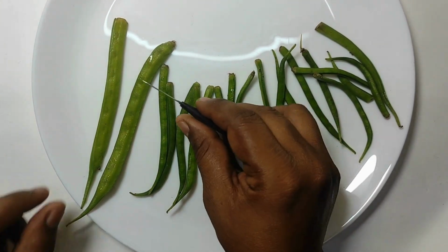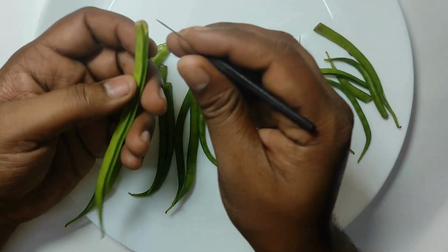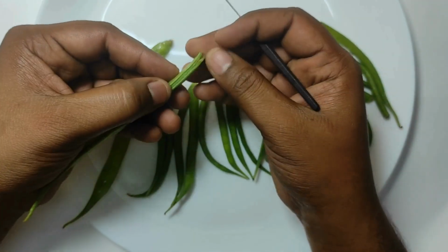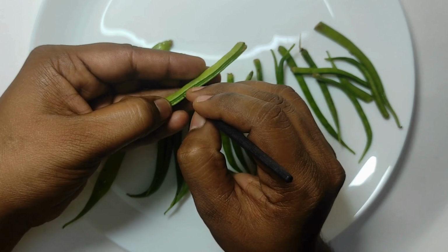Now take the pod or fruit of the Cyamopsis and split open as shown in the video with the help of a needle. Don't insert the needle too deep, it may destroy the seed.